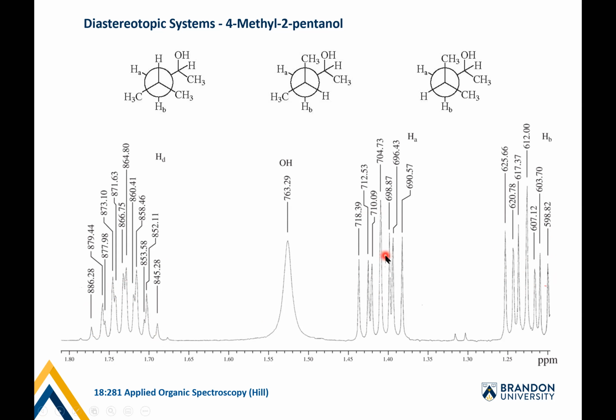So often when we're putting together practice questions, having peak systems like this on there makes analysis really, really, really hard. But the funny thing is that this is the common thing in NMR, and the N+1 rule where everything fits nicely is far less common for complex molecules.